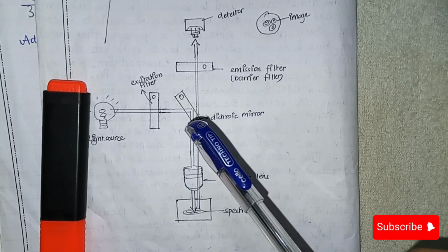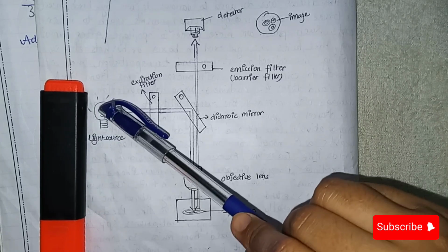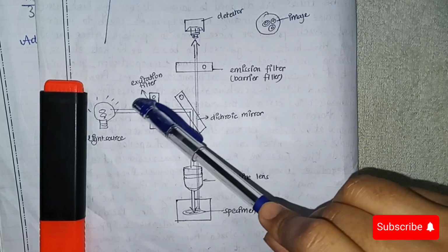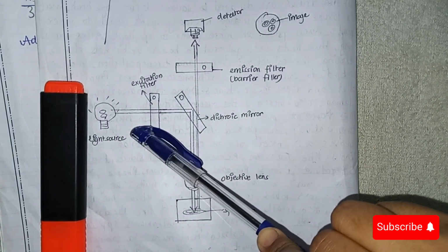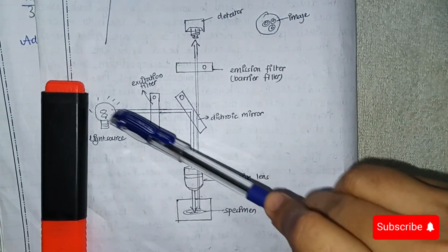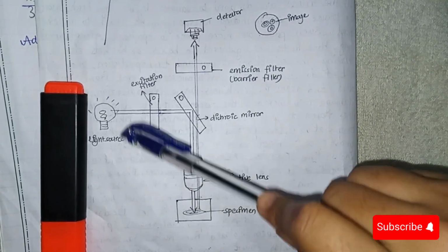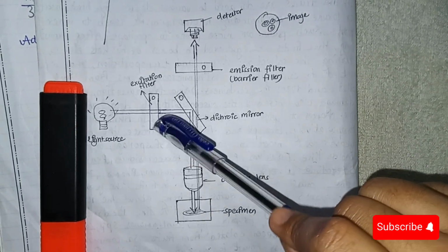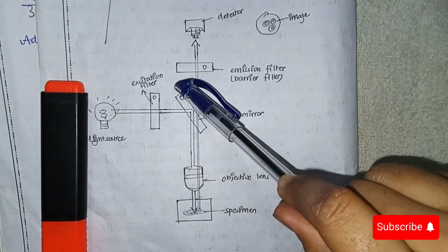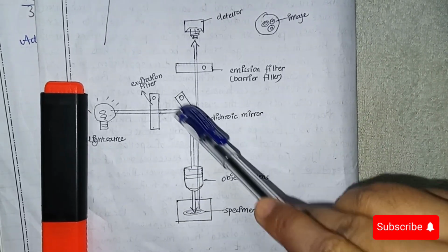A fluorescence microscope operates by utilizing fluorescent properties, we know that, and it starts with a high intensity light such as mercury or xenon arc lamp, which produces light that is directed through an excitation filter, and the filter only permits the light of specific wavelength. It does not permit the light of longer wavelength or shorter wavelength. The filtered light is then reflected by a dichroic mirror, which is at a 45-degree angle from the light source and the sample.